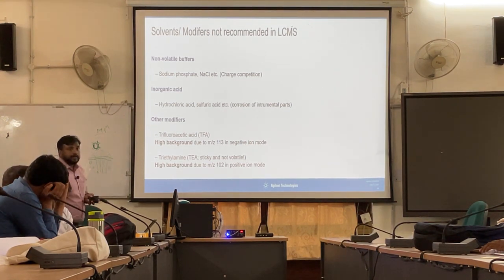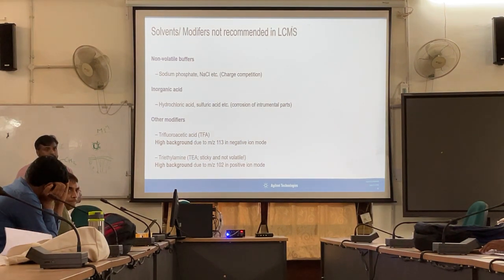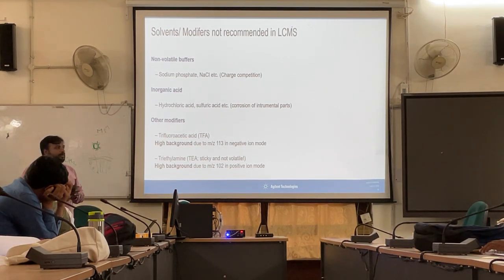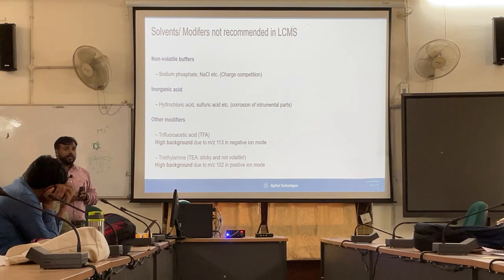If one of these chemicals is present in our analysis, we don't know. When we are analyzing unknown chemicals, triethylamine may be present. You are injecting 20 microliters as the injection volume, but assume you continuously inject the same ion into the source, then that is going to be a problem.